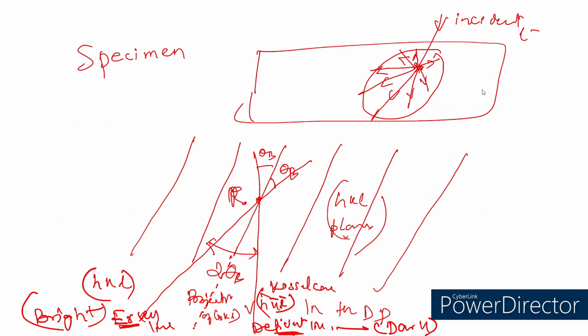So this is the basic geometry of the Kikuchi pattern. It relates what happens in the specimen to what we see in the diffraction pattern. The electrons generated here are scattered in all directions. We say they are diverging from a point, even though they are basically scattered at different points through the specimen thickness.